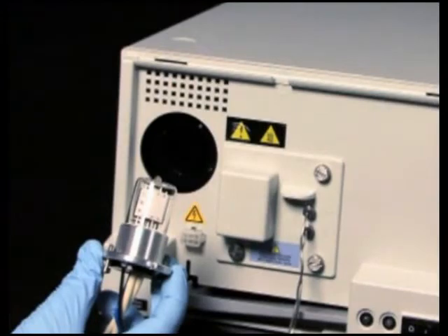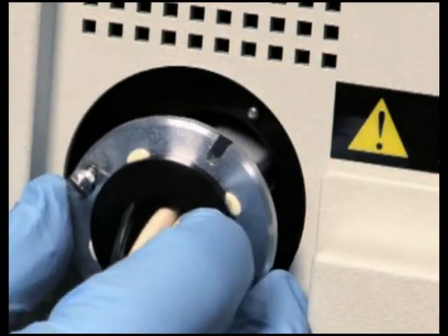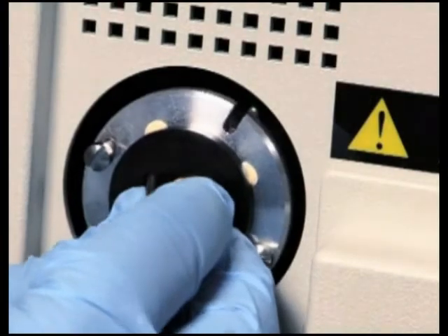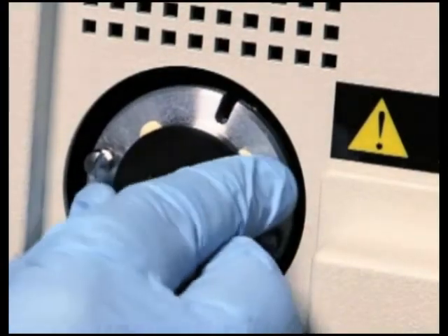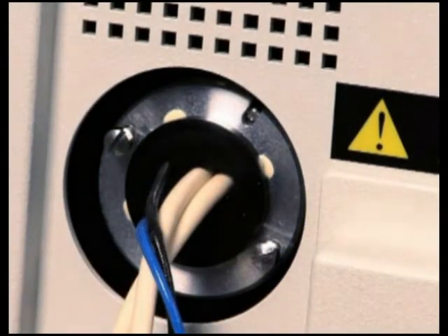Hold the replacement lamp by the base only, being careful not to touch the lamp glass. Position the lamp so that the cutout on the lamp base is at the 1 o'clock position and in line with the alignment pin on the lamp housing. Then, gently push the lamp forward until it bottoms into position.